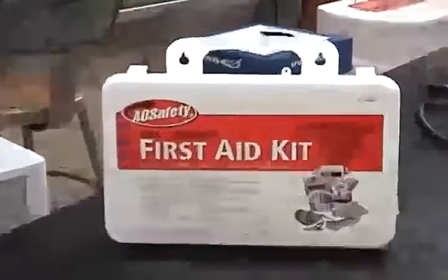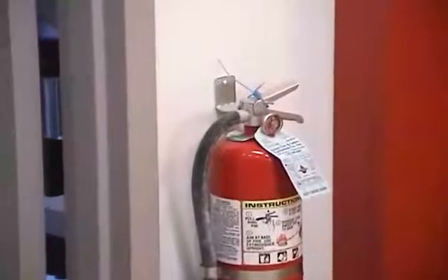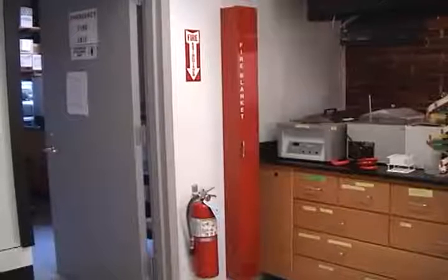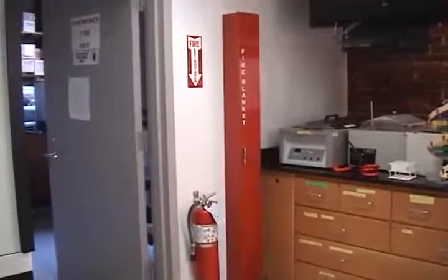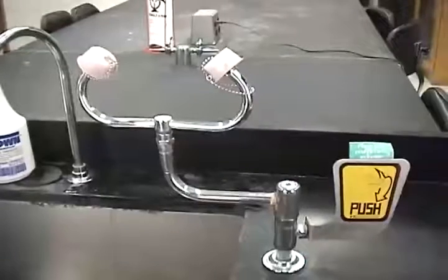First Aid Box, Fire Extinguisher, Exits, Fire Blanket, Chemical Wash Shower, Eyewash Station.